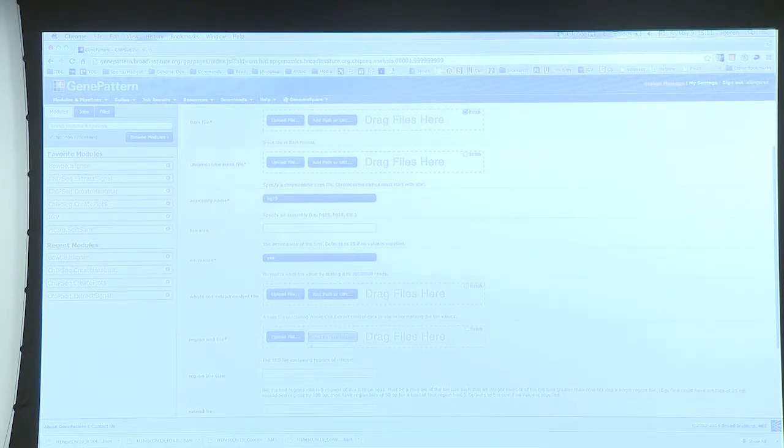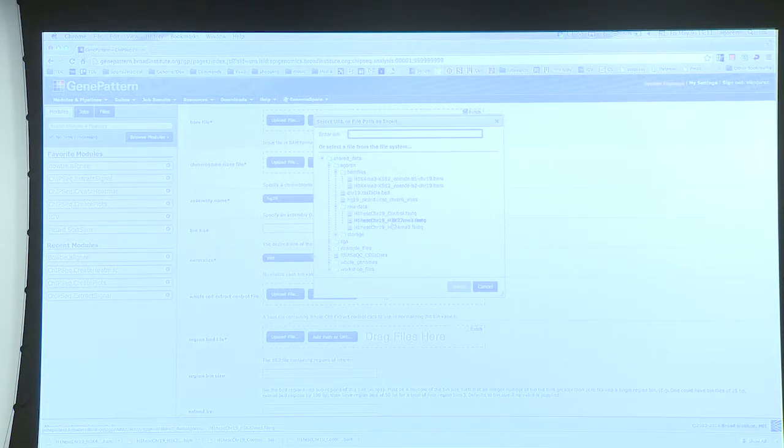the region bed file. Some of you, not sure where it comes from, because I made sure that we have only chromosome 19. Some of you got, I don't know, an old version. Perhaps it's in the storage that I put some old stuff, but make sure you use the one that starts with chromosome 19 TSS table.bed, which means that this is the TSS, the transcription start site table for chromosome 19 only.